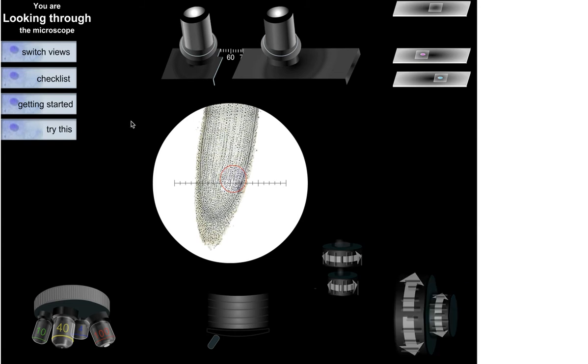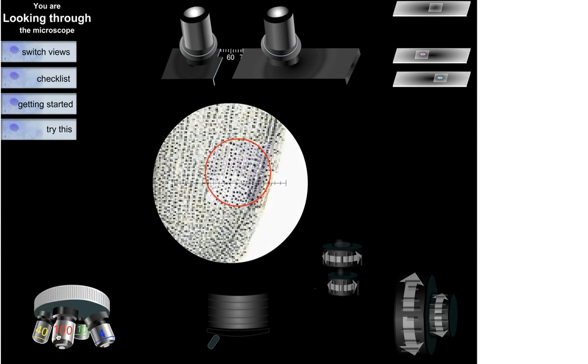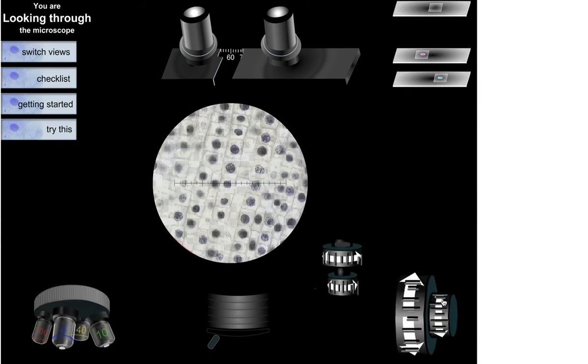Okay. And then we can go up to 10. See, a little nicer. And here you can adjust it a little bit. And then up to a 40. Yeah, so it's actually really nice. It's a nice program. Oops, and you can go in and out.